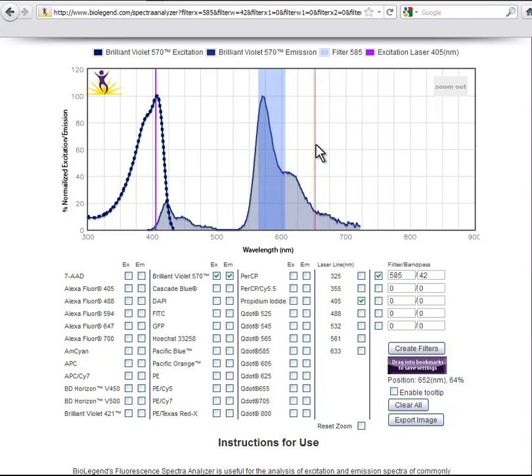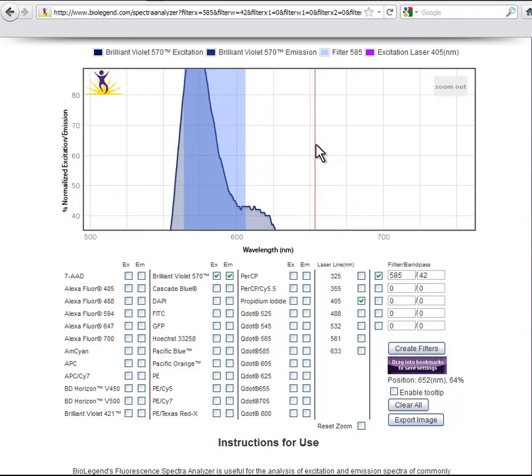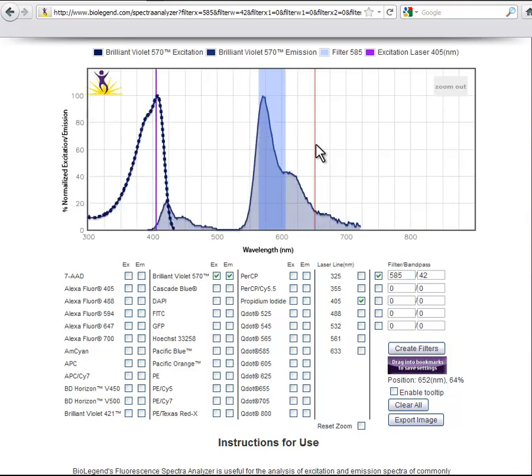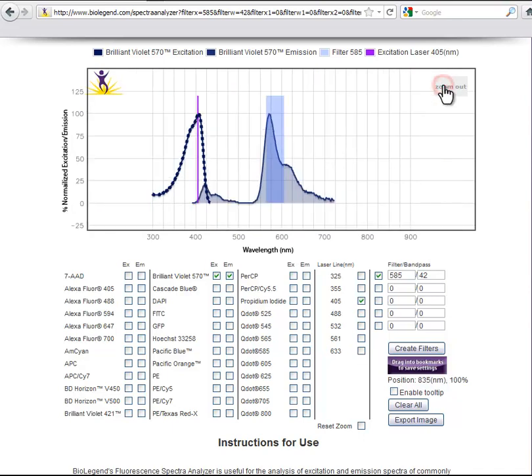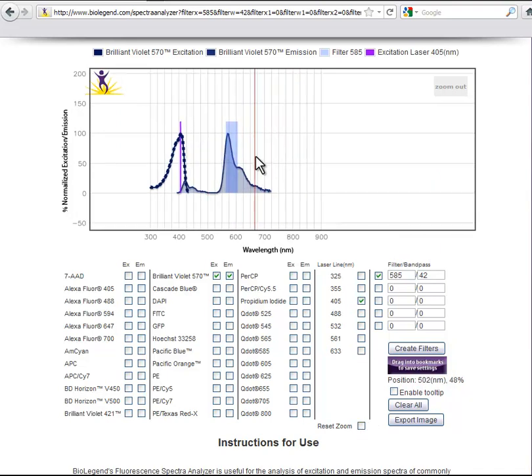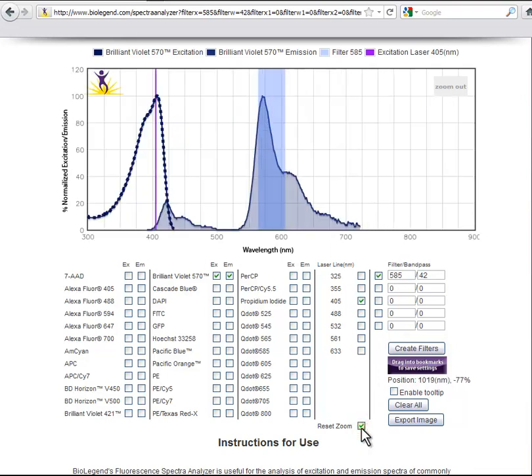You can zoom in and out on your selected graph, as well as pan in any direction. To zoom in, simply scroll the mouse wheel forward. To zoom out, scroll the mouse wheel backwards, or simply select the Zoom Out button in the upper right-hand corner of your screen. Left-click, hold, and move the mouse to pan. You can reset to the original view by selecting the Reset Zoom checkbox.